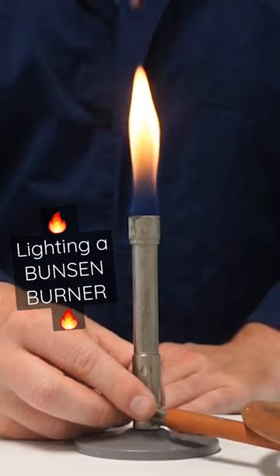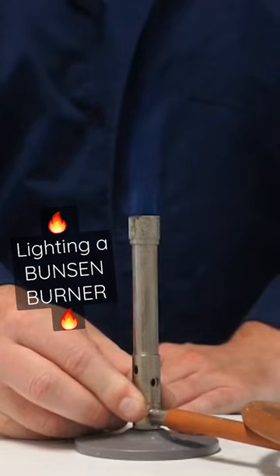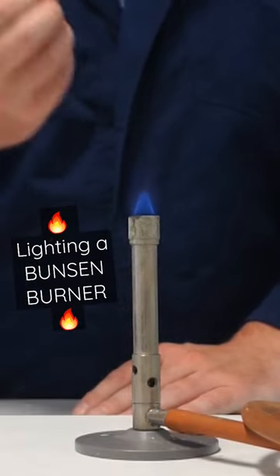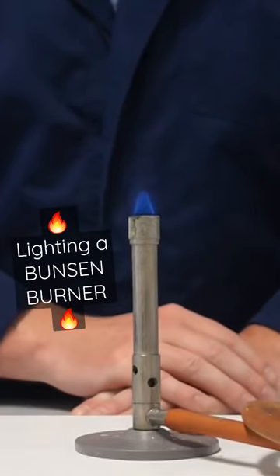I can now rotate the collar to open up the air hole, and in doing so, I'm allowing more oxygen into that flame, and the flame gets much hotter. It's now a barely visible blue flame, and this is the flame that we would use for heating.